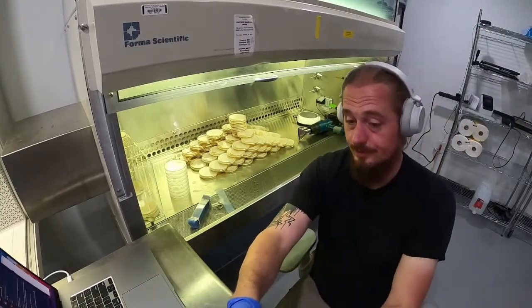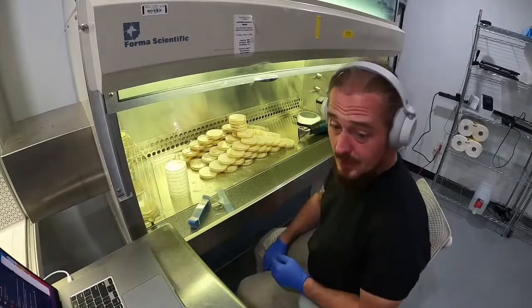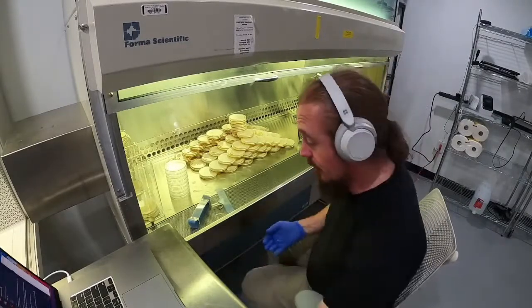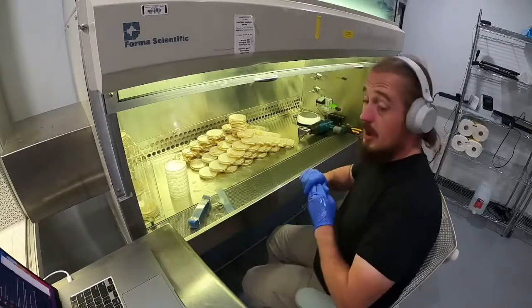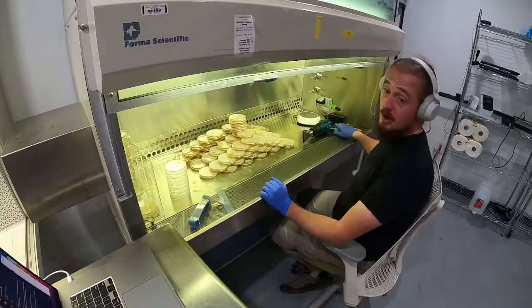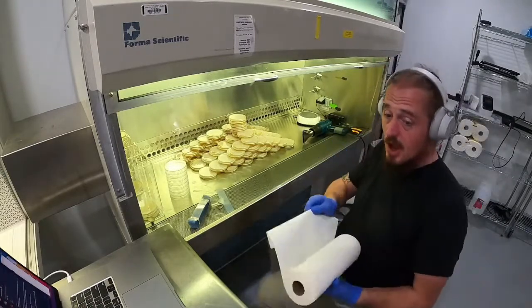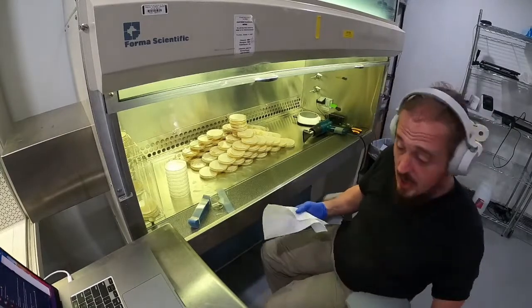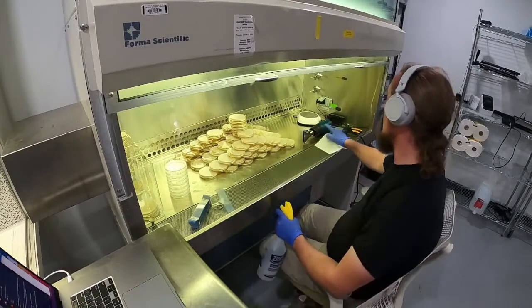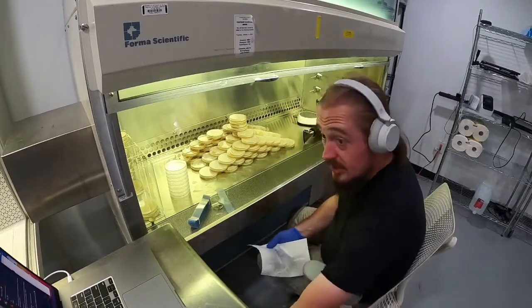All right. Well, now that I've done Instagram and I've redone it, let's actually get started. So for those of you on the stream and watching, I'm going to be sealing these agar plates. Now, I actually got a really good question yesterday when I was doing this. And the question is, how do you prevent contamination from the heat gun from hitting your agar dishes? And the answer is actually really simple.